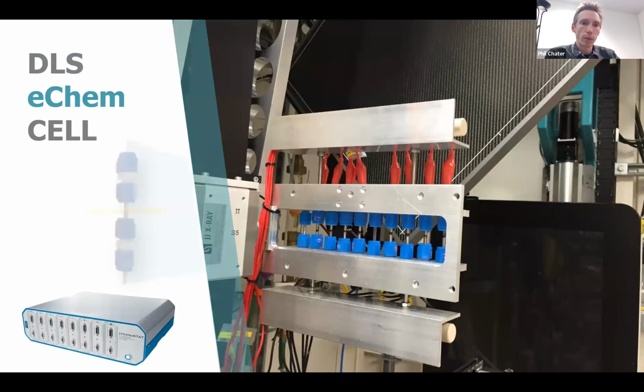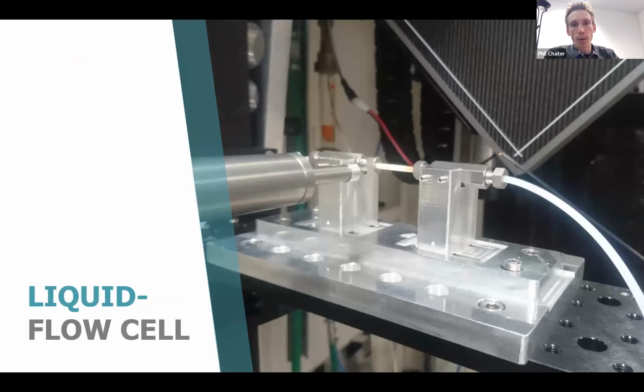Do quite a lot of battery work on the beamline. This was an in situ setup we developed to look at the in situ cycling of battery materials. And we've done a fair amount of liquid work on the beamline. This is a liquid flow cell. Actually, this is also used for looking at ion exchange. So this was an ion exchange experiment where we had, I think it was a zeolite in here as well, where we're flowing different solutions through and ion exchanging the materials.